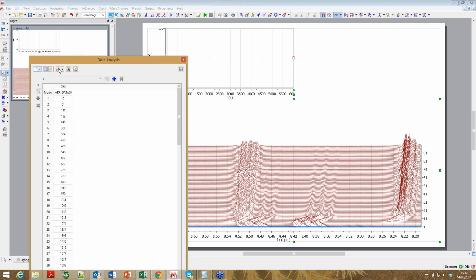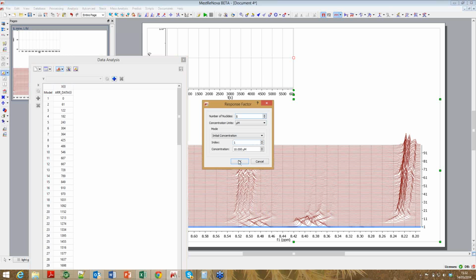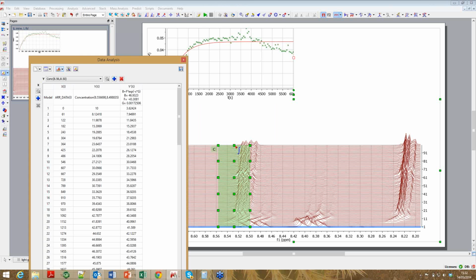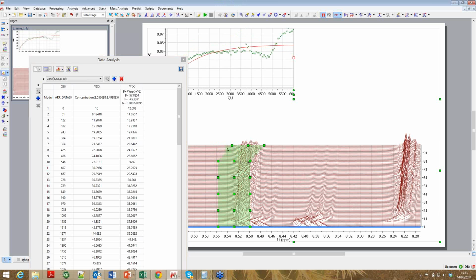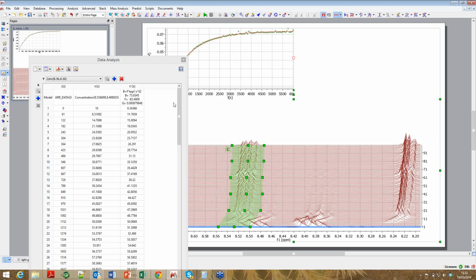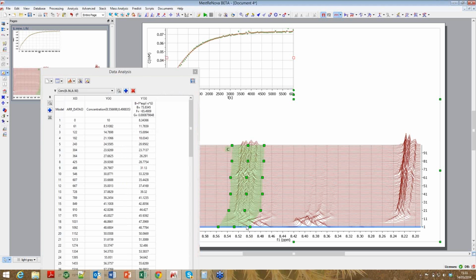As I've said, you can create a smallish area like that, and you can use these handles to move things around. I put it to you that having an algorithm that reliably works this out for you would be quite difficult. I can grab a bit of intensity from that there, so I'm going to squeeze that in a little bit like that.